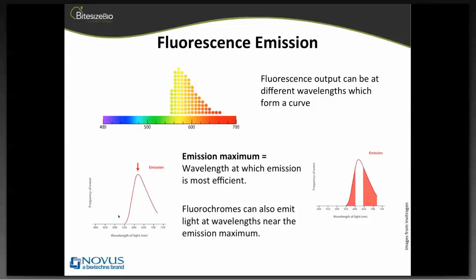A lot of cytometers will do this for you. You run automatic compensation, and I'd always recommend using automatic compensation, whether it be on the machine or running it afterwards on post-acquisition software. FlowJo can do compensation for you because it can do it much more accurately than we can. So make sure you run your single color controls, and if you can, try and avoid compensation by trying to get fluorochromes that are far apart.